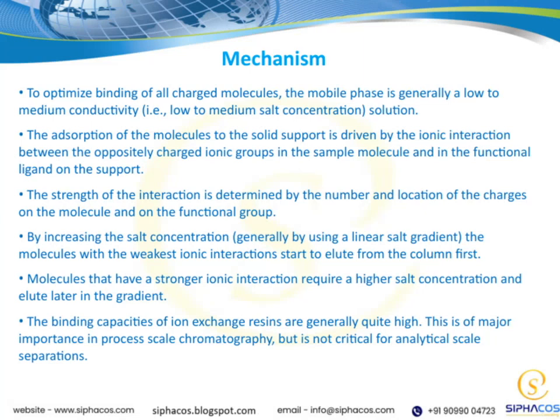Let's dive into how the mechanism of ion exchange works. To effectively bind charged molecules, the mobile phase typically has a low to medium conductivity, which means it contains a relatively low to medium salt concentration. This environment helps promote ionic interactions without overwhelming them. The key driver here is ionic interaction itself. The molecules in the sample bind to the solid support through these electrostatic forces.